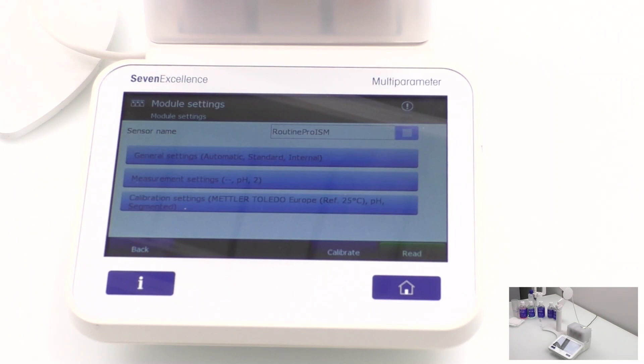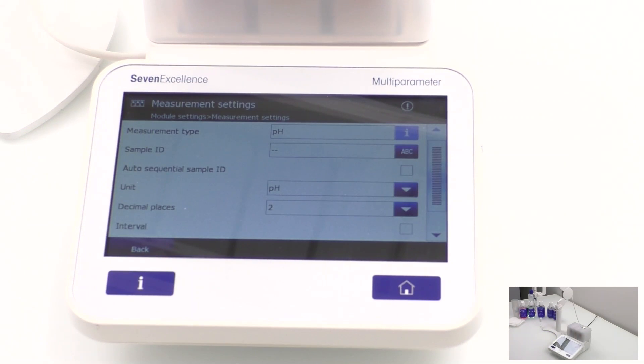Next, select Measurement Settings and keep pH for the measurement type, and the unit and decimal places set to 2. Then, select back.